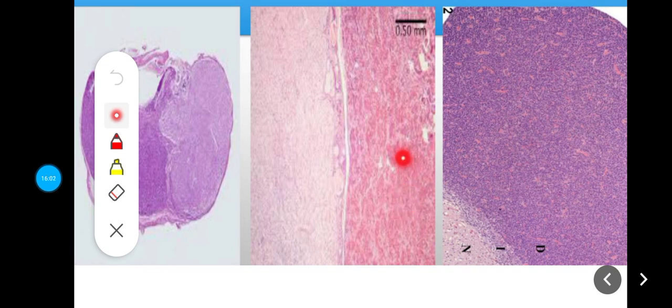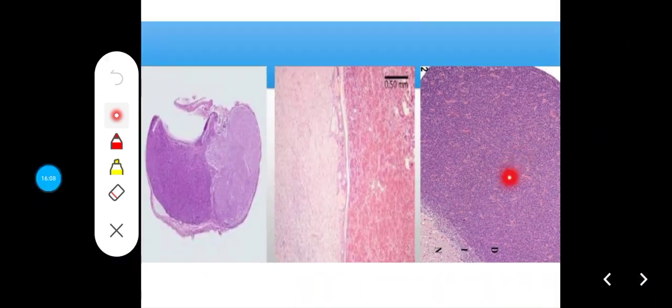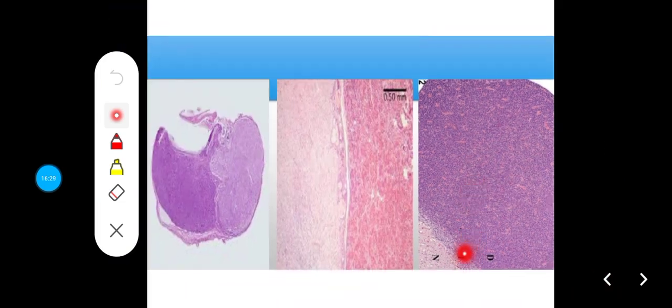So that's the reason why the anterior pituitary has this kind of varied cell appearance, just as you can see here. You can see some bluish staining areas with some pinkish staining areas. You can appreciate that. Some pink staining areas within blue staining areas, and then you can see the sharp demarcation that doesn't take up much stain, and then you can see the posterior pituitary that doesn't stain well. So the slide of the pituitary gland is pretty much easy to identify.